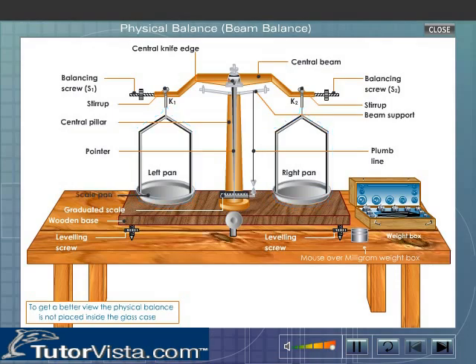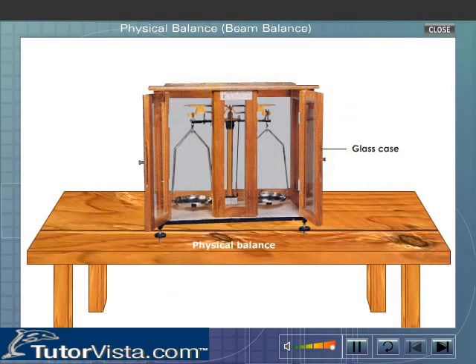Two scale pans of equal masses are suspended from the stirrups. The balance is enclosed in a case provided with glass doors.